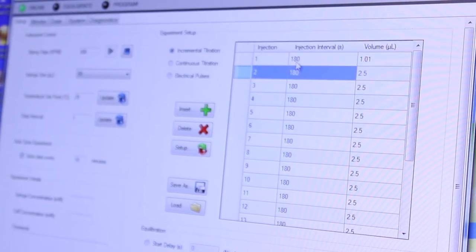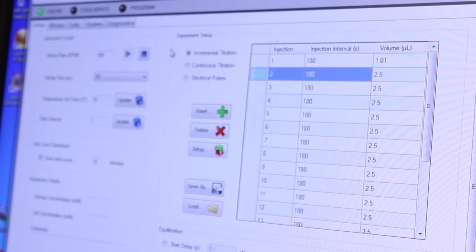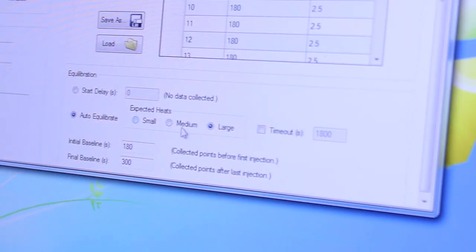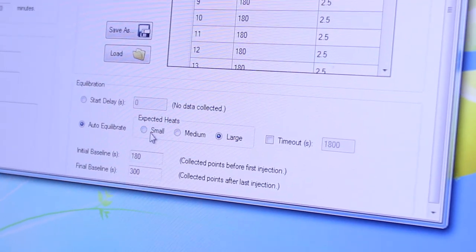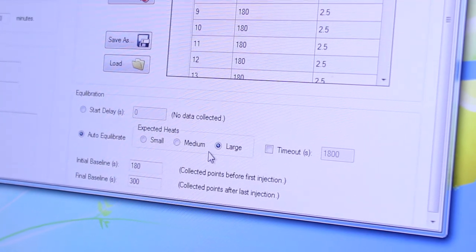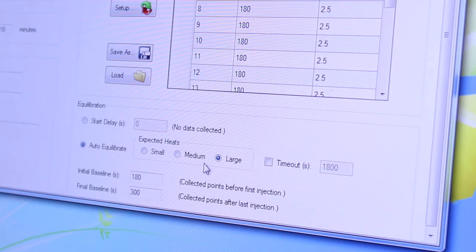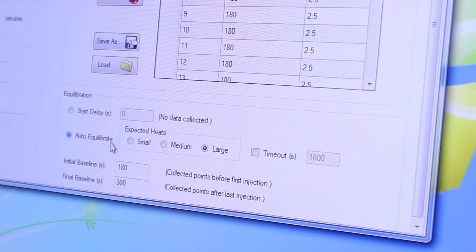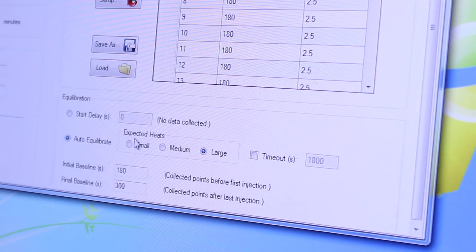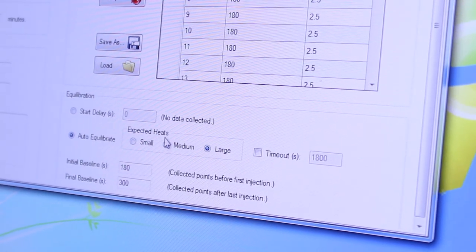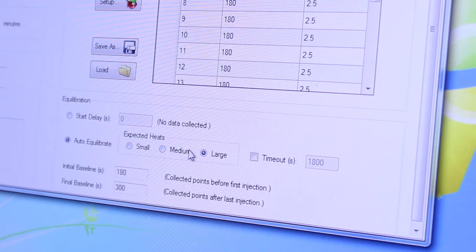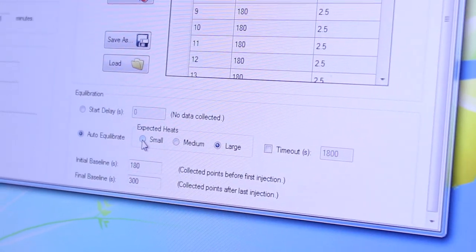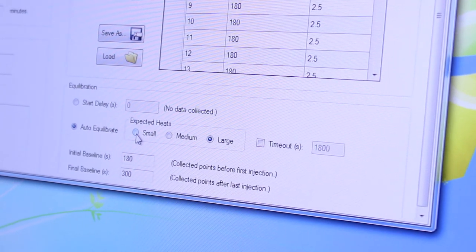The instrument is already starting to equilibrate but we can use this auto equilibrate option down here to help ensure that the instrument has fully equilibrated in terms of temperature stability before starting the experiment. The three options here for expected heat small, medium and large basically set how much error is acceptable before starting the experiment.